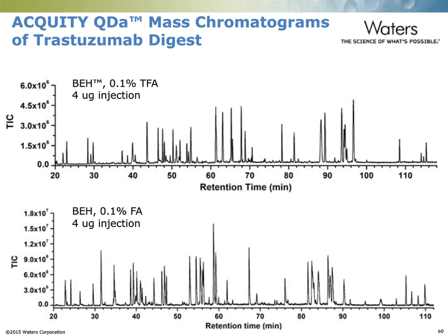Even, I don't show the data here, we've seen peptides up to 7,000 molecular weight and even greater going up to some of the subunits.